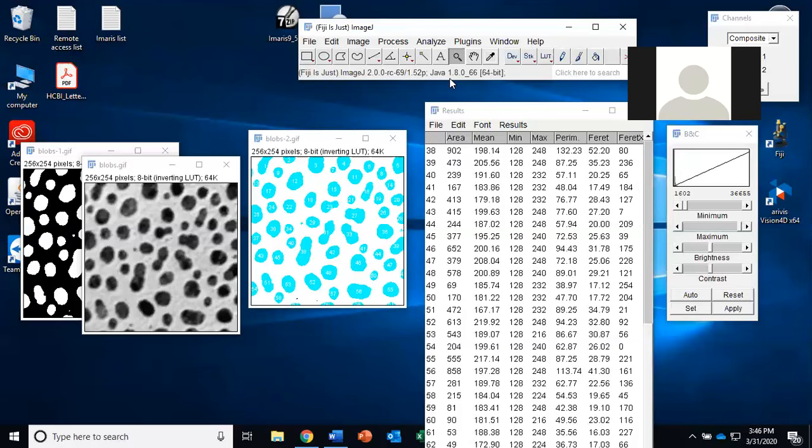I'd just say that as far as the correlations go, it's very important to do something like the Manders coefficients, where it does take into consideration how much of each marker is there. So like when I said, when you have that situation where you have green everywhere and magenta only in small areas, you don't want to calculate how much green co-localizes with magenta. You want to calculate how much magenta co-localizes with green.